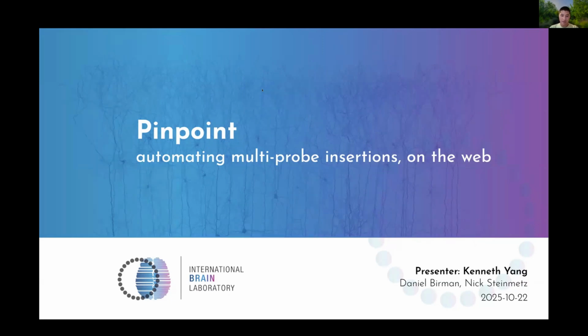My name is Kenneth. I'm a master's student at the University of Washington studying computer science, and I was part of the team that helped develop Pinpoint, the electrophysiology trajectory planner and automation tool. It's available on the web and on desktop.